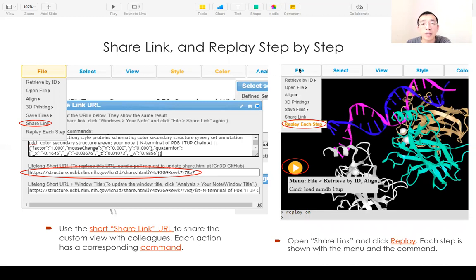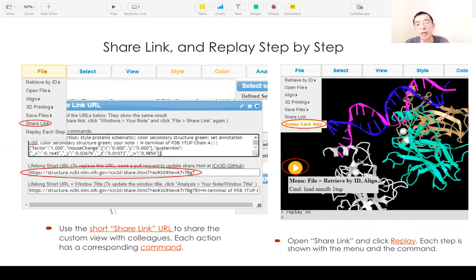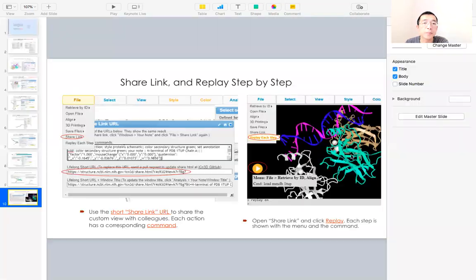There is also an option called 'Replay Each Step'. If you click that, it will show the view step by step from the start to your final view. That's all for the first part.